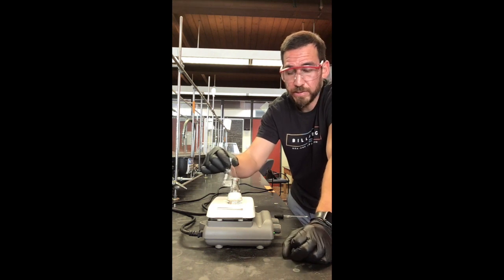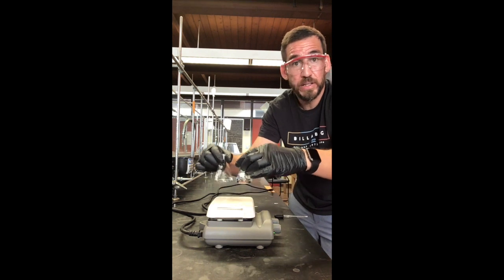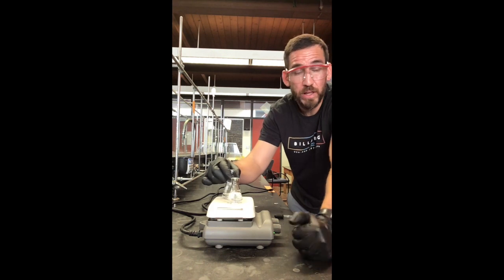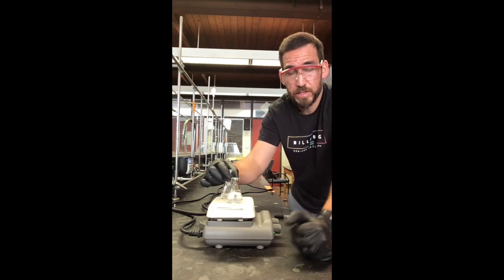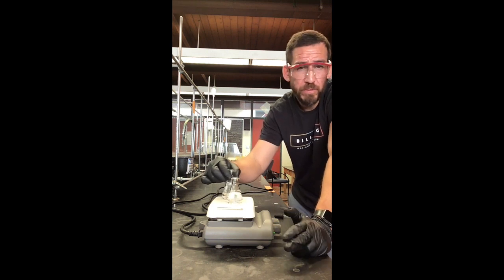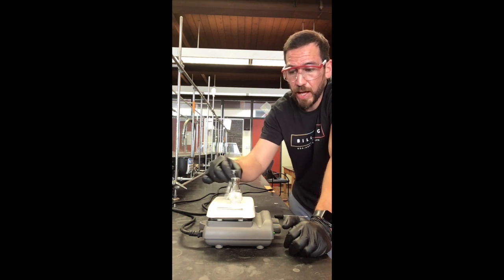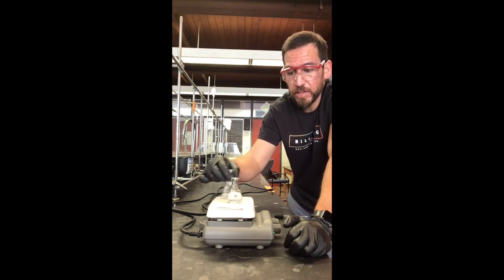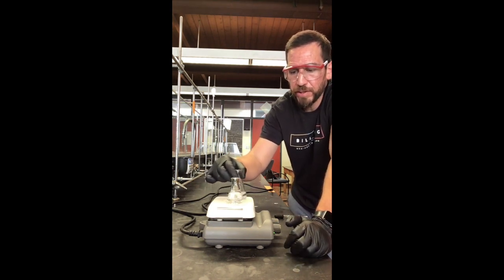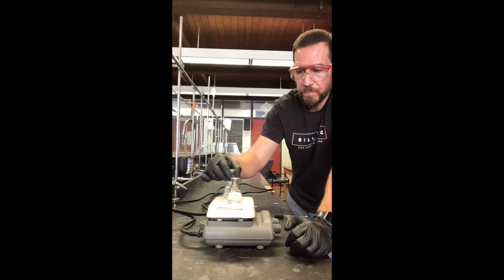filtration apparatus. That way we can do a vacuum filtration to isolate the lovely caffeine crystals that we've obtained. And then that will allow it to dry as well, because it's a vacuum filtration. It will remove all of the ethanol after 5 to 10 minutes, and then we can weigh it and see how much we've got. I didn't show you the weighing out of this material because that's kind of lame, but I will give you that final number in the end. Okay, and again, we started with 508 milligrams.